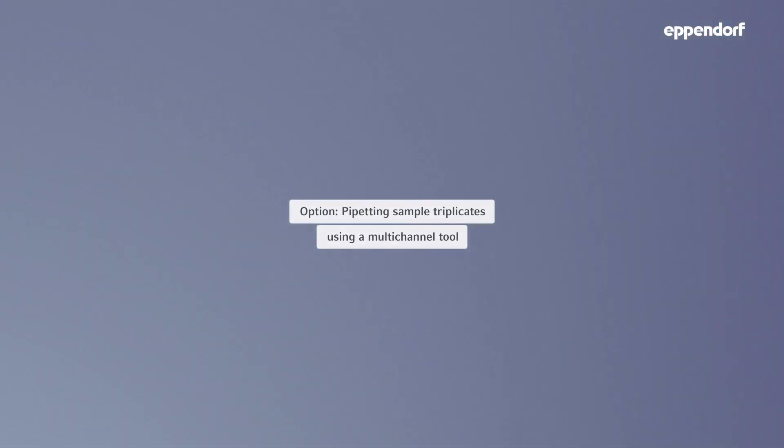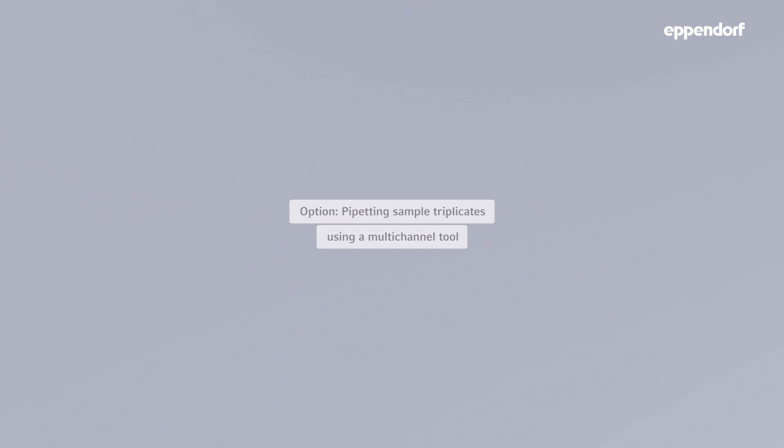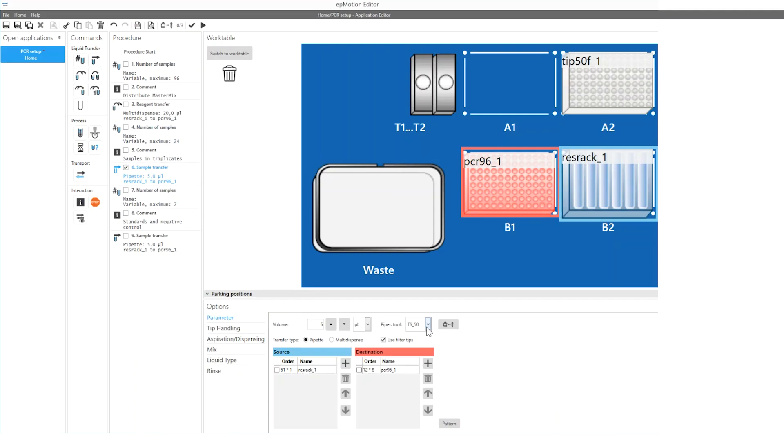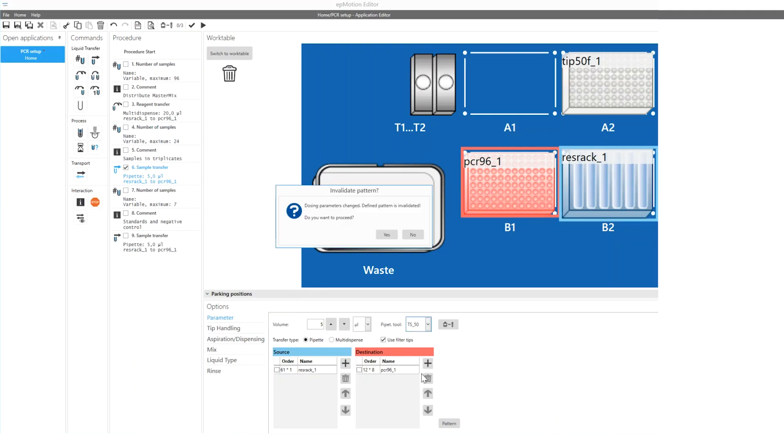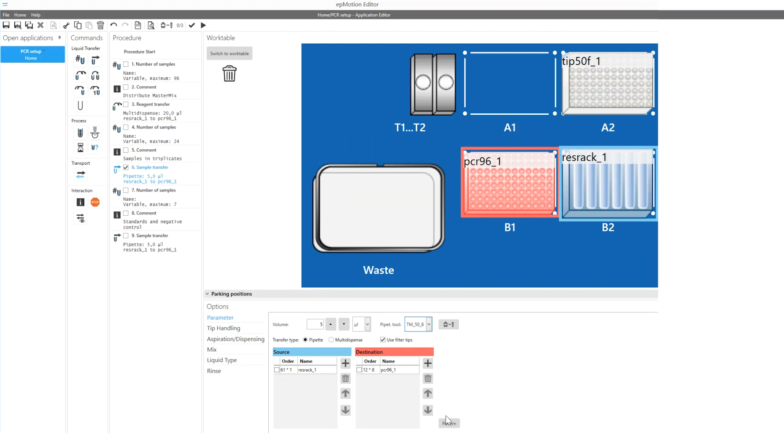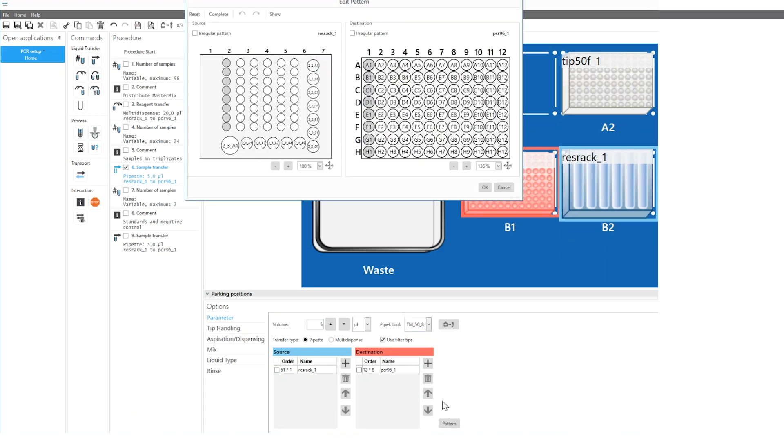If the samples can be accessed by an 8-channel tool, you can speed up the sample pipetting. The previously set procedure can be quickly adapted by changing the selected pipet tool and adapting the pipetting pattern.